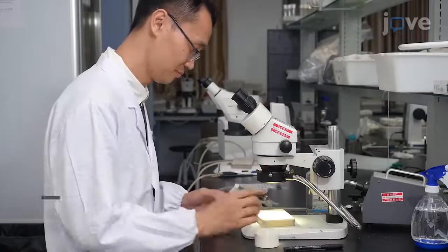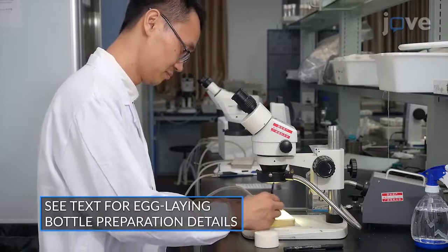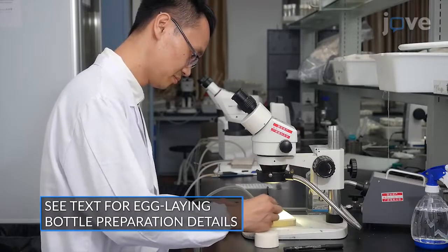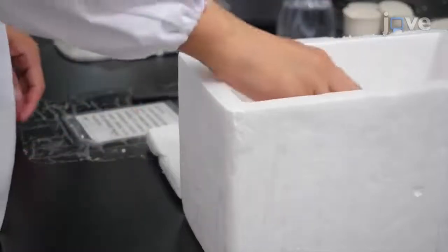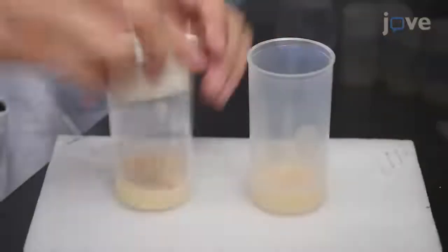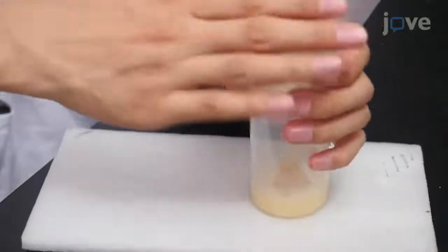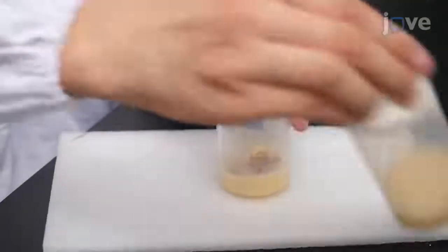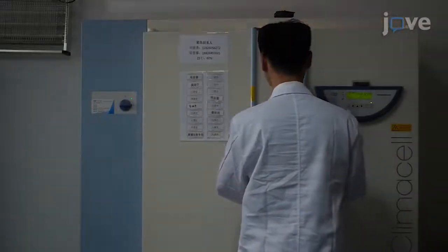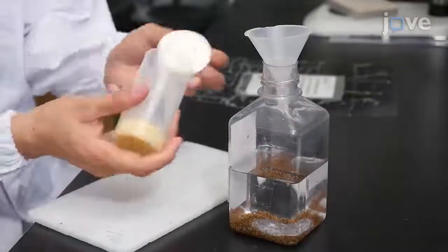To induce egg-laying, place 150 virgin female flies and 75 males of the desired genotypes in an egg-laying bottle and place the bottle under a light-proof box in a 25 degrees Celsius incubator with 60% humidity. After one hour, transfer the flies to a new bottle and let the flies lay eggs in the new bottle for one hour before removing the adults.